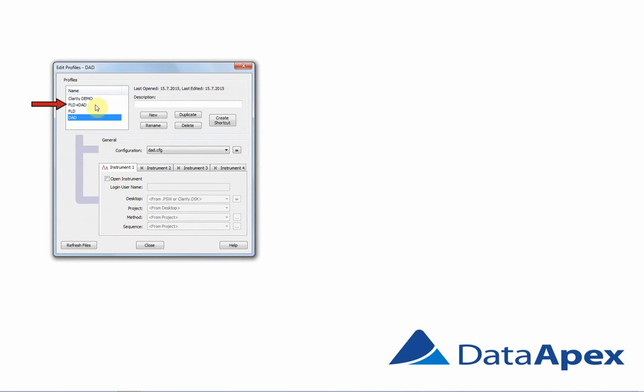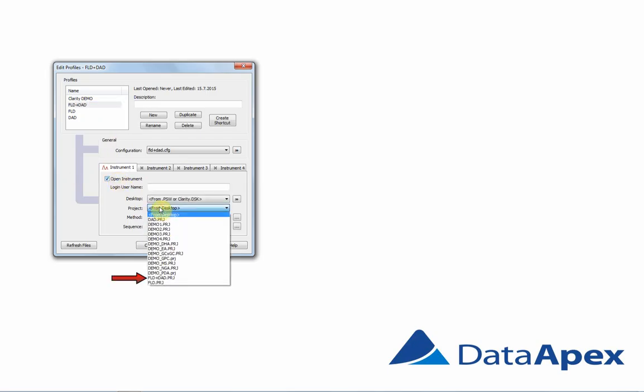Now, since the configuration is completed, we can specify what projects and methods will be opened when we launch separate profiles. For that, go back to the Edit Profiles. Click on the specific profile. We want to open it on the first instrument. Select project. I have already prepared FLD plus DAD projects, so we can open it. And method FLD plus DAD.